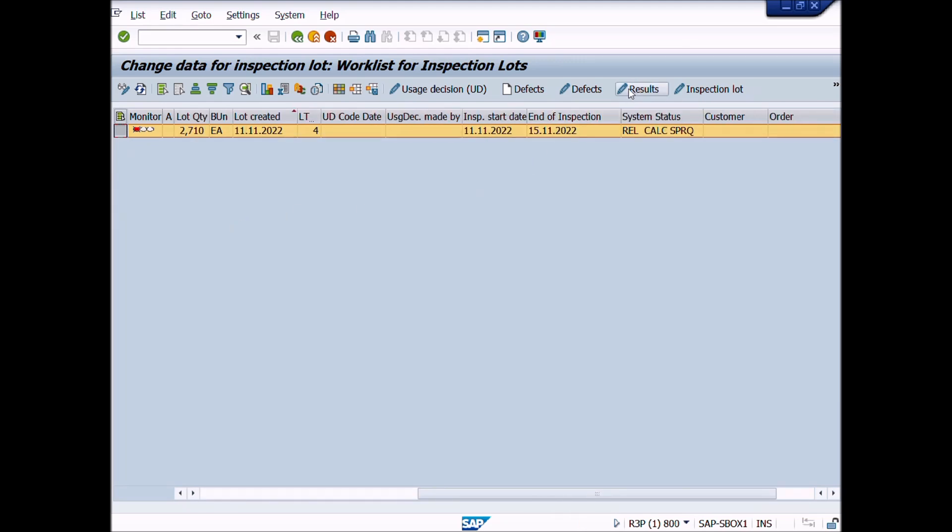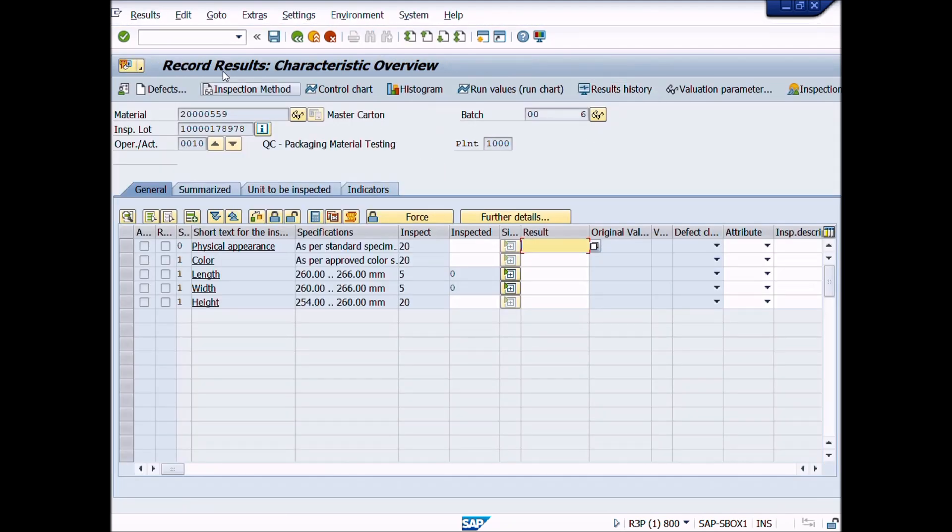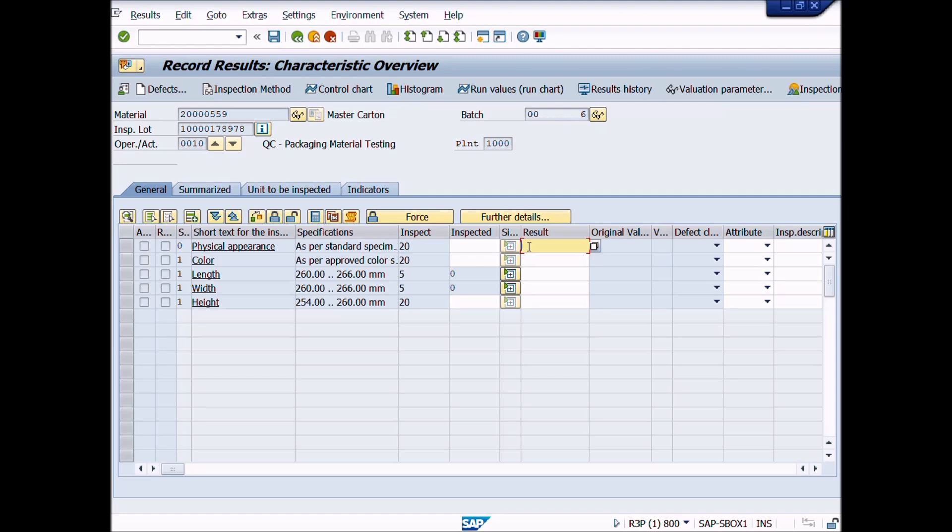A new window will appear: Record results, Characteristic overview. You can see here inspection characteristics which we have assigned in inspection plan. In lecture number 10, we have learnt how to create an inspection plan. There are 5 inspection characteristics displaying here for this inspection plan and we will enter inspection results for each inspection characteristic.